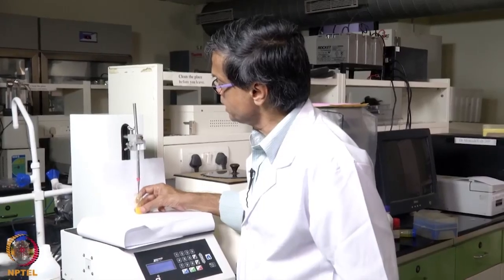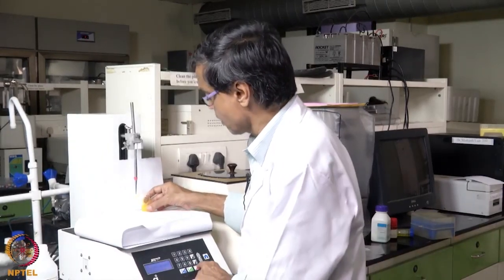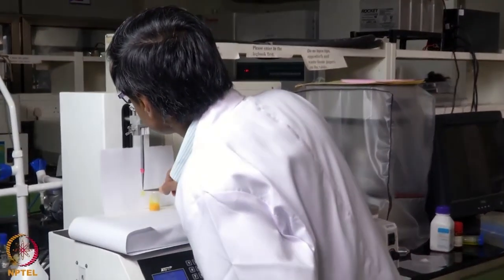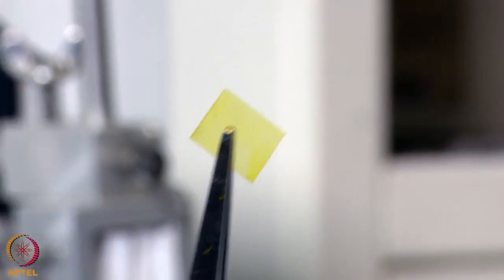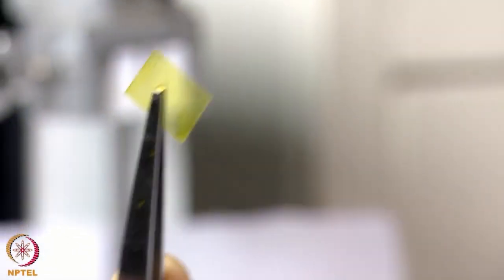Now we can remove our sample. This is a curcumin coated polyester with the PVA as the binder.